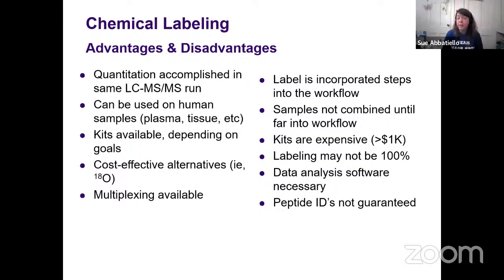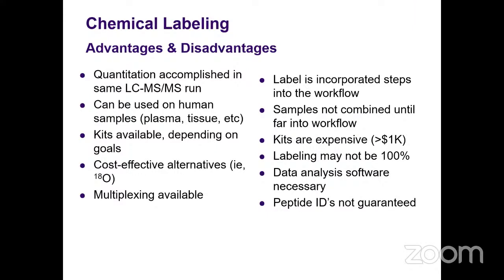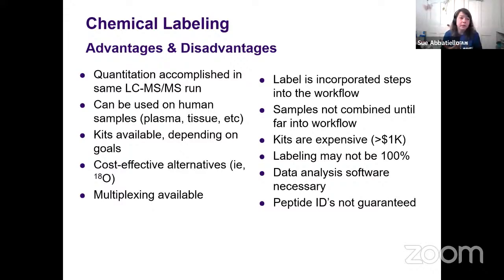So they can, yeah, I mean, they can, and there's a lot of flexibility to the experimental design. When looking at an iTRAQ or TMT labeled sample, you can define the top N, meaning it's going to do MS1, look at all the peaks that are observed, and then pick the top N number, whether it's 10 or 20 or whatever, and isolate those to do MS2 on them. And that will give you the peptide sequence plus the quantitative aspect.